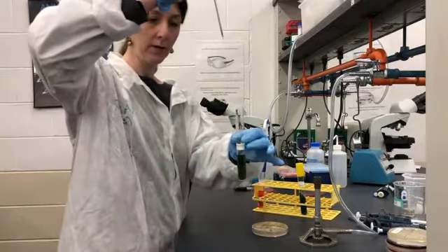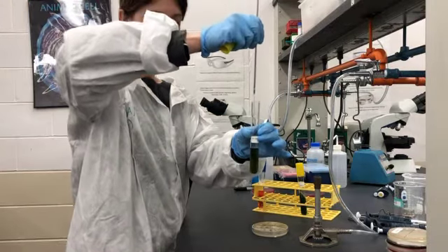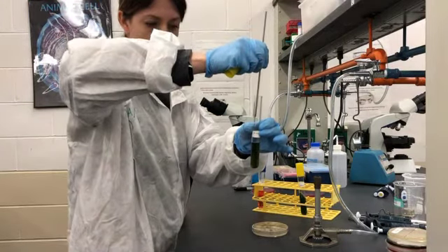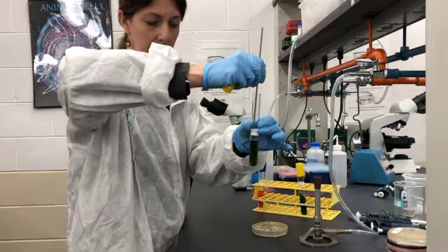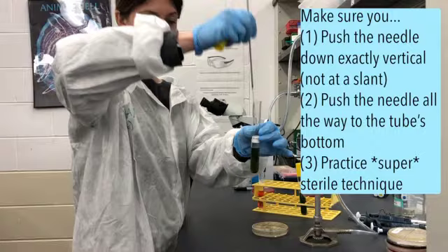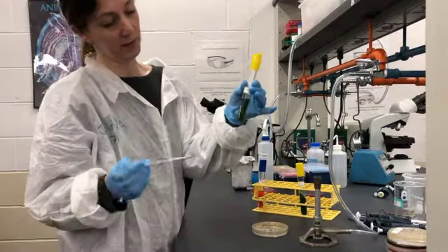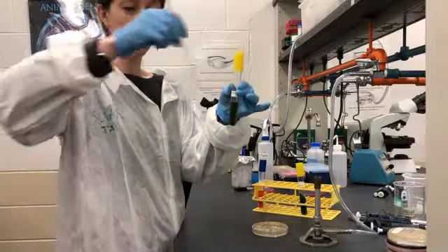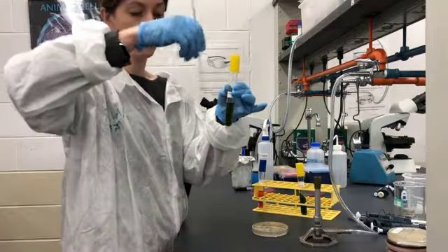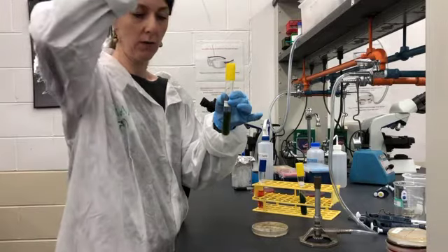And now to inoculate a semi-solid, you want to go down into the media all the way to the bottom, and then you want to come up. Your goal is to have a single point of inoculation. You're not going to be able to make it perfect, but what you don't want to do is stir it around. You're not trying to mix up the media. Instead, you're just trying to stab it all the way down and all the way up.